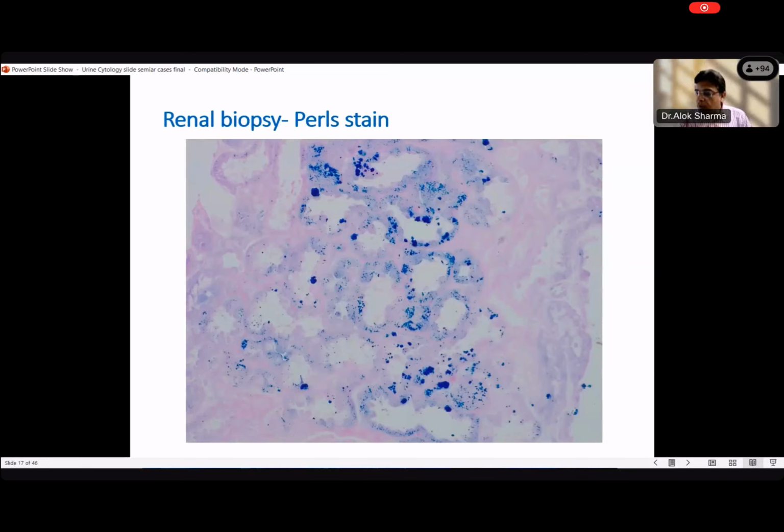which came to us. So maybe Surabhi, you can just quickly spend some 10 seconds on this picture and explain what has happened here. Basically here I can see deposition of iron in the tubules, like tubular deposition of iron, which shows that there is some kind of intravascular hemolysis happening, which is in turn causing hemoglobinuria and further resulting in hemosiderinuria, which is getting deposited in the tubules, and it is staining positive for iron. So this is basically staining the hemosiderin, right? Hemosiderin. So this is pearl stain.